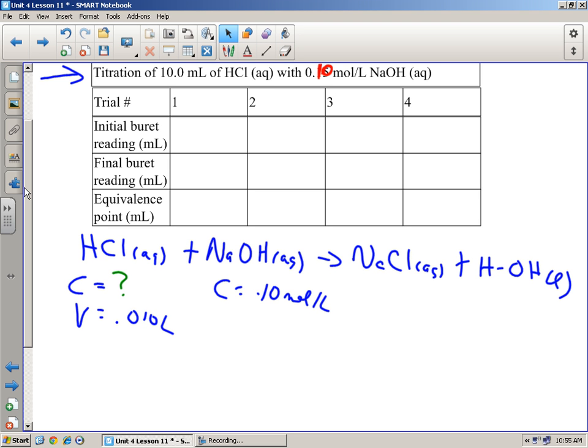You have to fill up the titrant always. I don't care what it is. You always have to fill it up past 0. So the 0 mark is down here, guys, you have to fill it up past there. All right? And now you're just going to simply lift this up here. And the reason you fill it up past 0 is because it'll be hard for you guys to see, but you'll see this tomorrow, I promise.